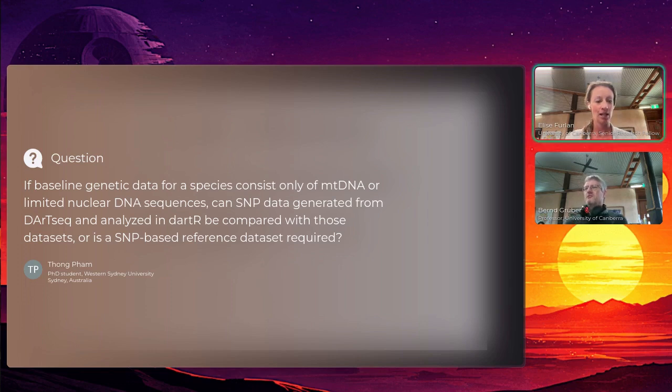Okay, yeah. Anyone from Dart who can answer that? We mark it as not answered and not answerable. I would have thought you get mainly nuclear data when you do dartSeq. Anyone? No? It seems like it would be very different. Yeah, I would think so if that's the case. But okay, assuming you have only mitochondrial data, then yeah, okay. So we'll assume.